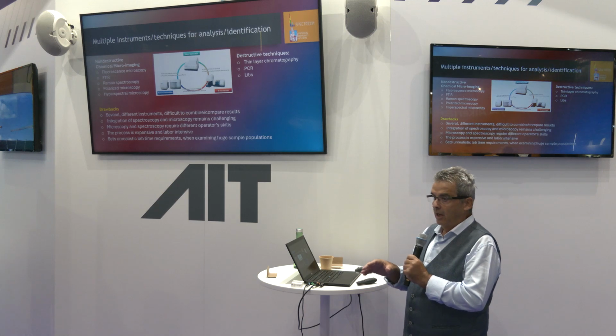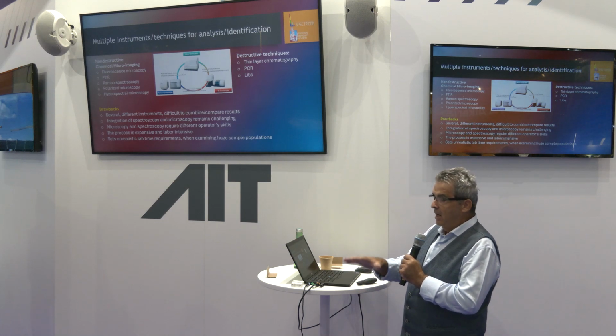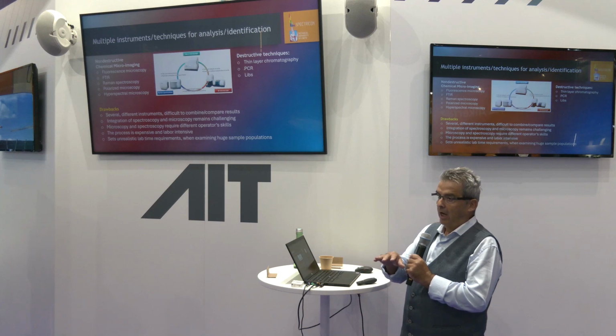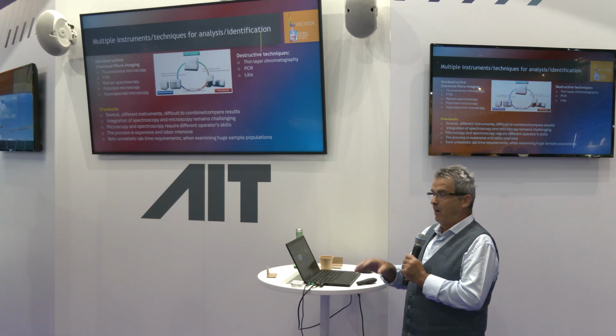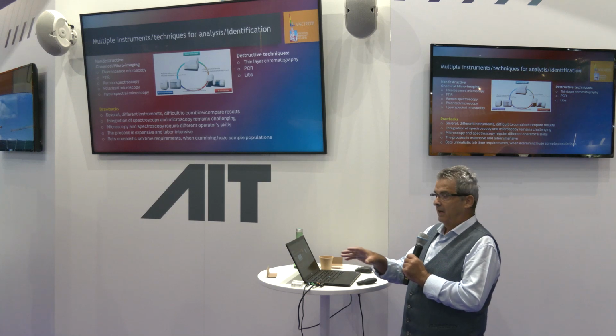So the idea is, is it possible to scan a full region of a crime scene, put the samples on the microscope and do an analysis that runs in a completely unsupervised manner, and after 3 or 4 hours give you results about the chemical identity of the traces and be able to classify whether there are some existing materials.